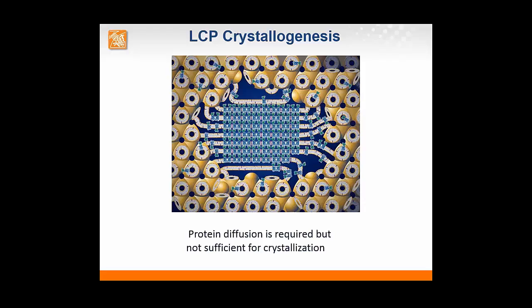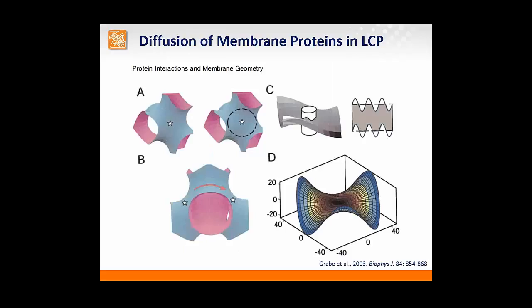So let's look a little bit more in detail at how membrane proteins diffuse in the lipidic cubic phase. And here I'm showing you in panel A a single unit of lipidic cubic phase with Pn3m symmetry.